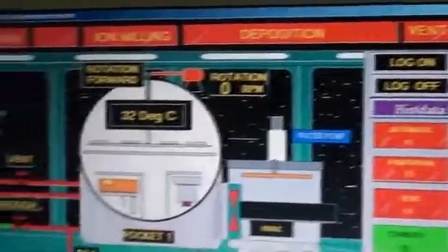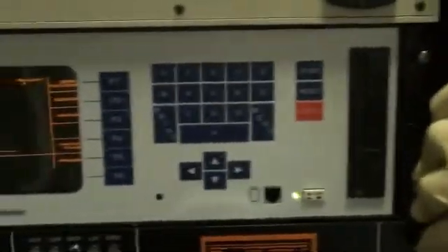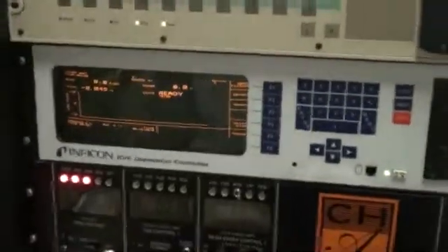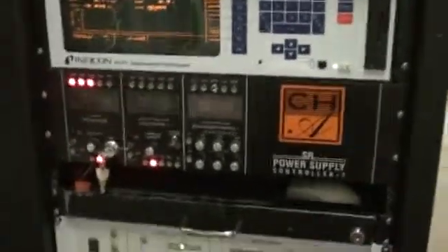Okay, this Siemens controller — this is our computer, this is the automatic control for the system. This right here is our Inficon controller, our IC5 deposition controller. This is what controls your deposition rate and thickness. That is one of the brand new controllers — several of these controllers are brand new on the system as part of the refurbishment. This IC5 is brand new. This controller right here is your power supply controller. That controls the high voltage and emission current.